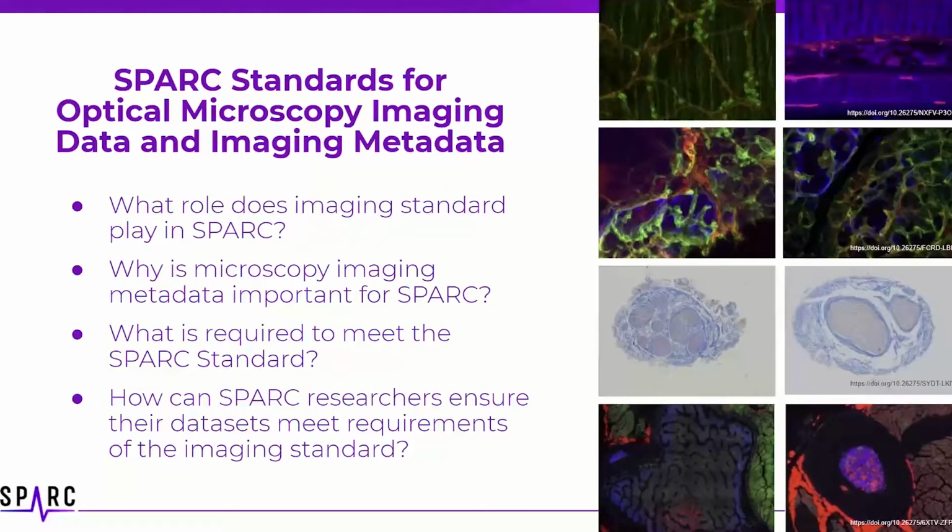Like, look at some of this gorgeous SPARC image data on the screen. These examples come from different experimental data sets and use different modalities for acquisition, channel target labels, and the size. Recording this information about the experiment within the actual file as metadata will make it easy for those in your lab and outside your lab to interpret the images on their own and as a part of the data set as a whole.